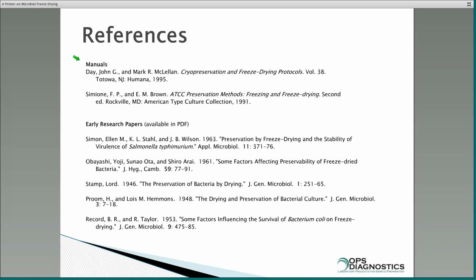freezing will be slowed, so it will still freeze, but it won't flash freeze. So minus 80 can be used. It's just that at minus 20, you'll definitely end up with bigger pores for the water to get out.